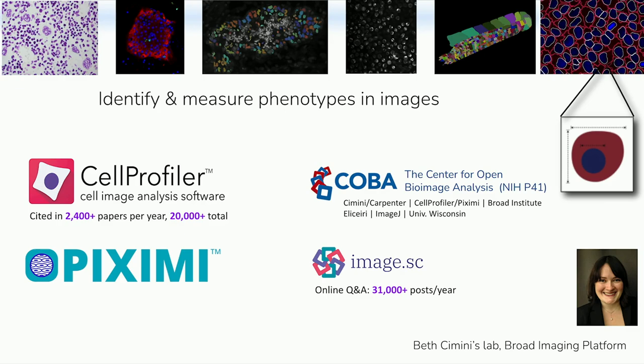I can still remember, it wasn't that many years ago when we were like, okay, deep learning looks promising, but there's not really anything that's so concretely useful that we really desperately have to be using it right now. Whereas now it is often the case that we have image-based biological problems where deep learning segmentation, for example, or tracking is really actually concretely useful. So we've gone through that shift in our field, and it's been really exciting to watch that develop over the past decade or so.